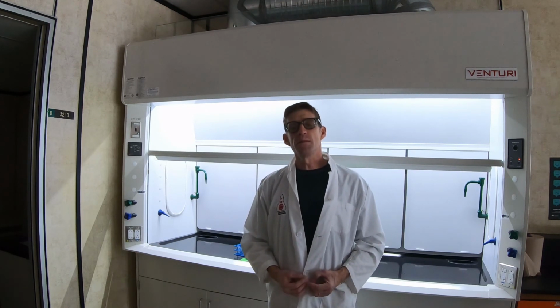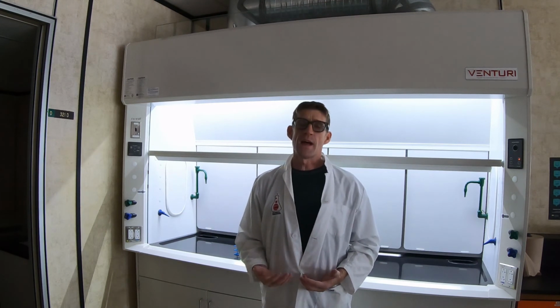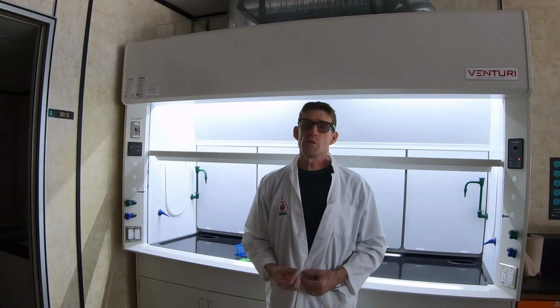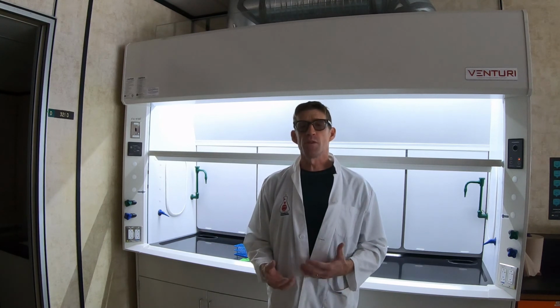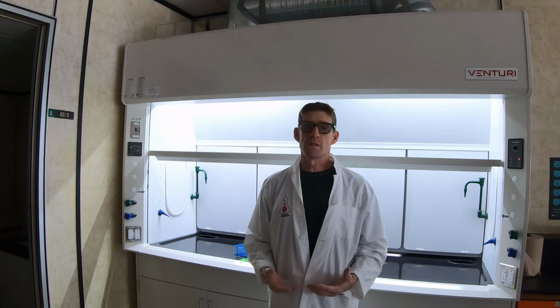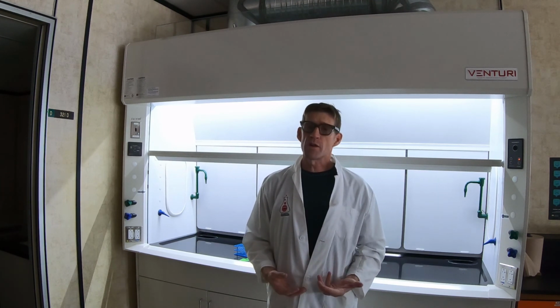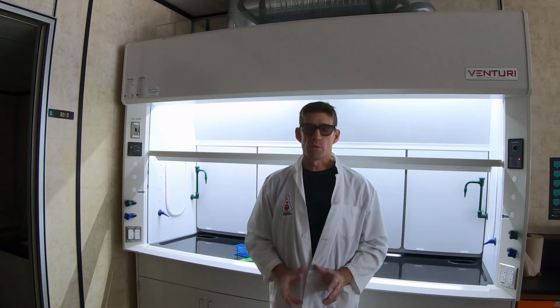When they go to the GC mass spec, we'll actually be analyzing the vapor above the solution. That's representative of the solution intact, and because our GC mass spec is very sensitive, we require very, very little material. As a result, the solution won't be analyzed, but rather it's the vapor over top of the solution. So it's not required that we remove the water using brine and a drying agent. We are simply going to be analyzing the vapor. So the workup, as described in the manual, is not going to be completed. In fact, it's made quite a bit easier by analyzing what is referred to as the headspace.